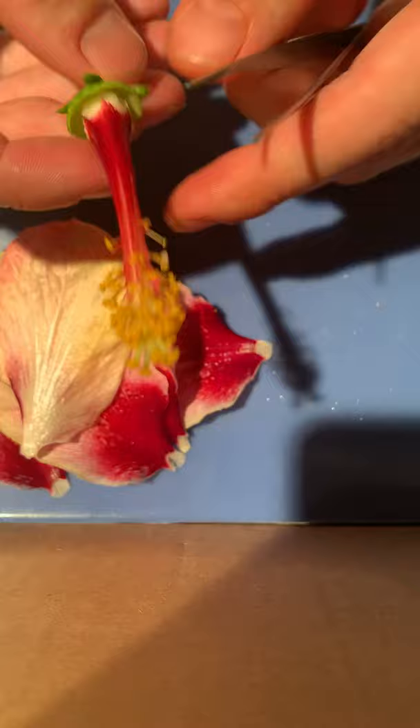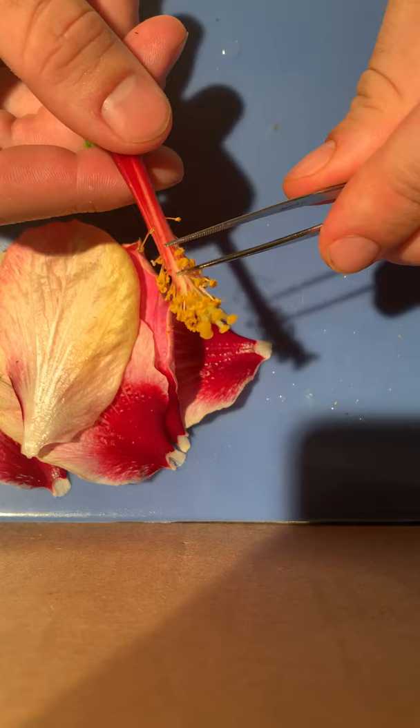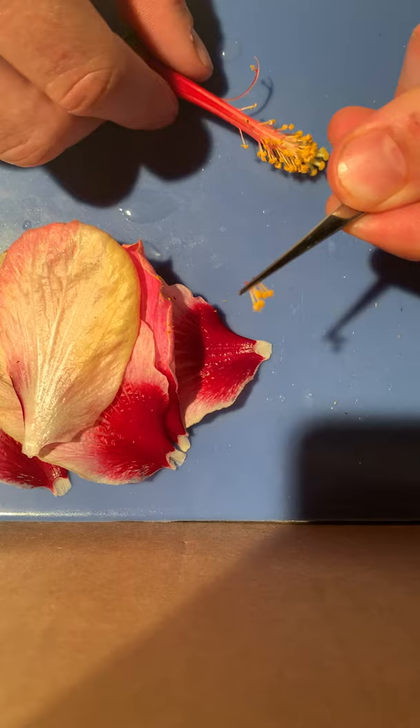I'll remove the stamen so we get a closer look at the female reproductive organs. Here's a look at a few stamen together.